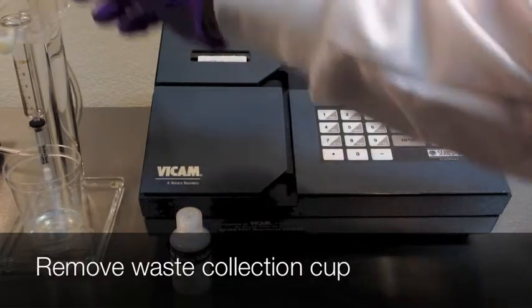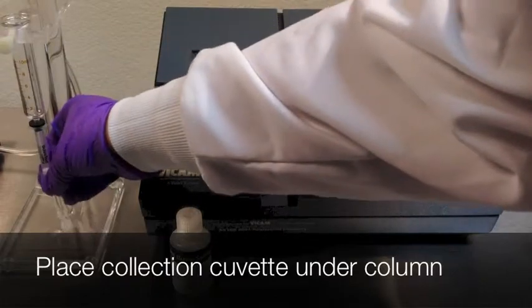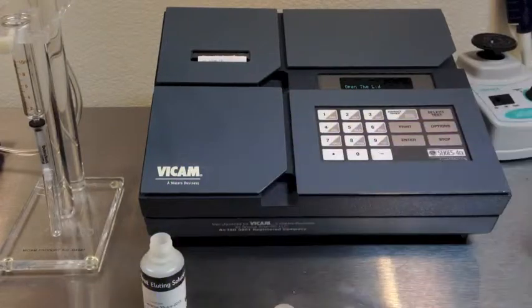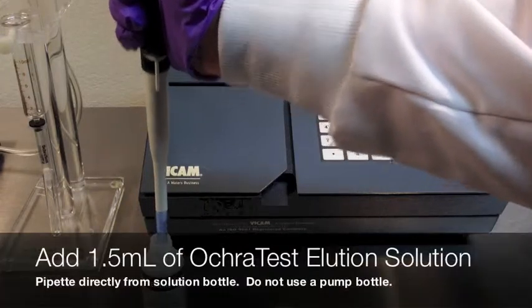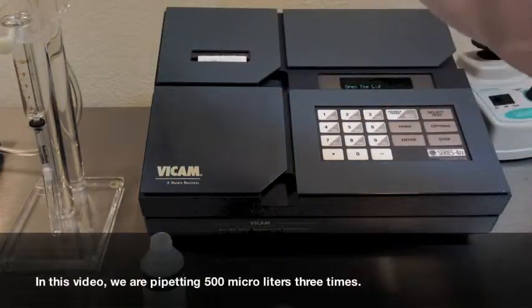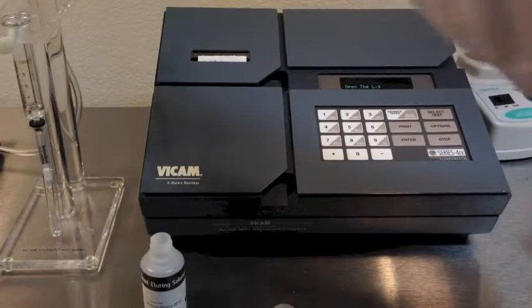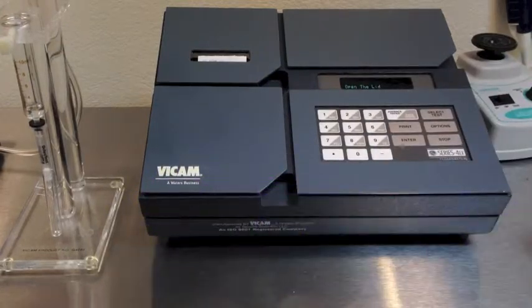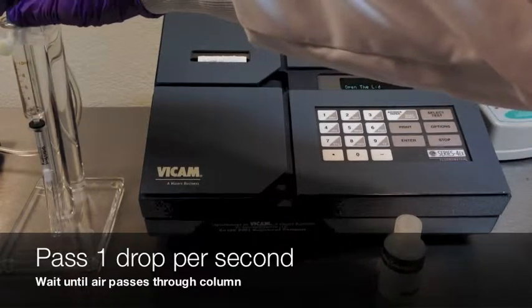Remove the waste collection cup and replace it with a clean cuvette. Pipetting directly from the okra test bottle, put 1.5 milliliters of elution solution into the syringe — in this case, taking 500 microliters and doing it three times.